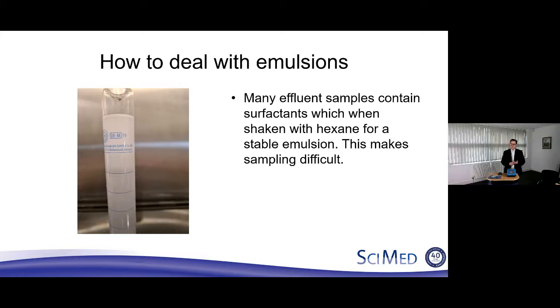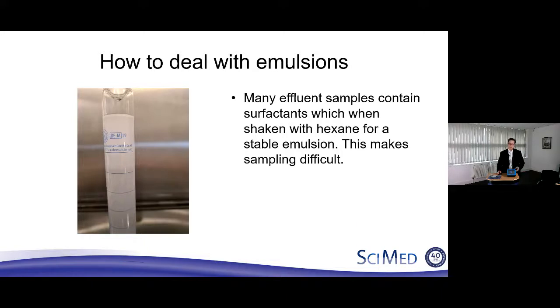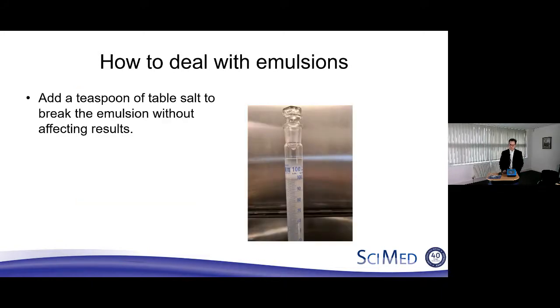A common problem with samples containing surfactants is that rather than getting two nice discrete layers, an emulsion forms — it's very hard to see where the hexane-water separation is, and with more surfactant the emulsion becomes more and more stable and will never separate out. The simplest solution is adding a teaspoon of table salt, which immediately starts to break the emulsion. Sodium sulphate also works very well. After about five minutes of resting, the sample will then have two nice discrete layers.